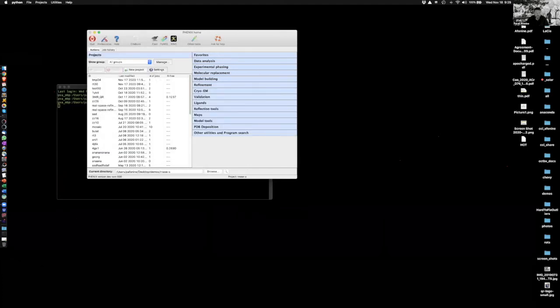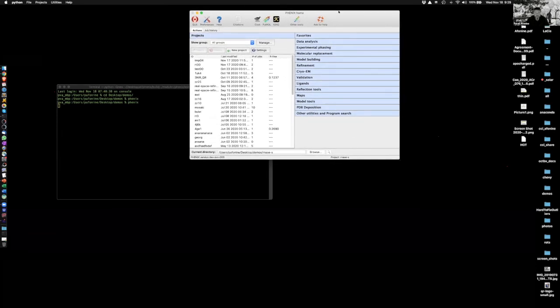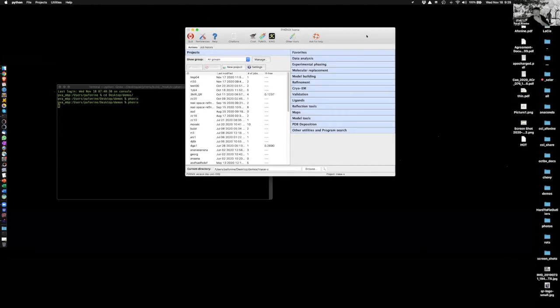And before we run Refinement, I'm going to illustrate very quickly how we do validation. That's very important because, as I mentioned, Refinement and validation come hand in hand. You always do validation. You need to know what problems you address when you run Refinement. So you don't want to run Refinement blindly without realizing where you are. So it's always a good idea to run validation.